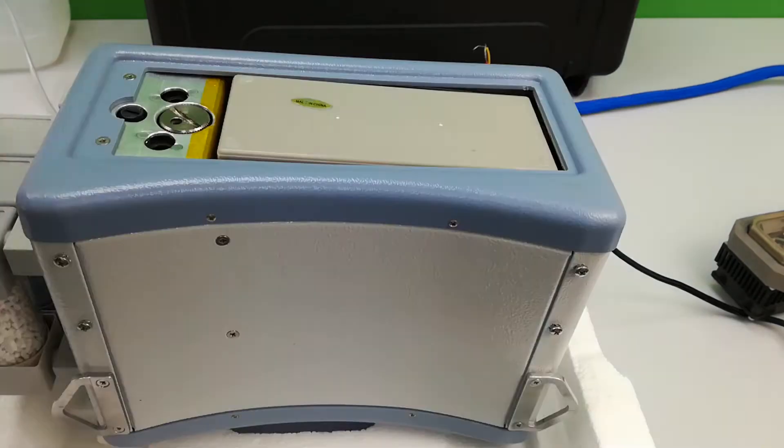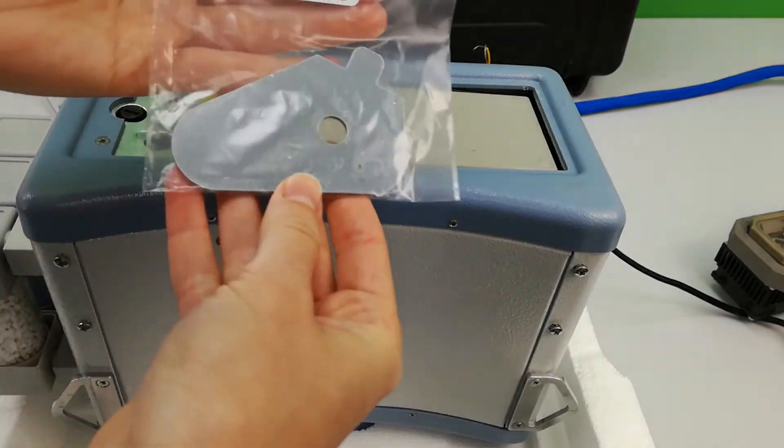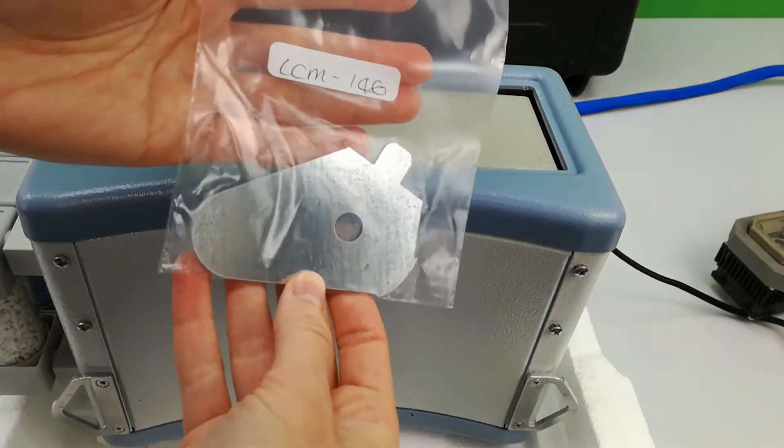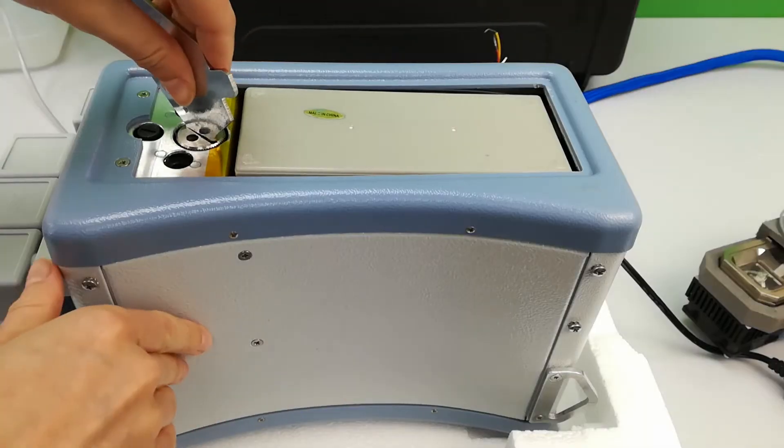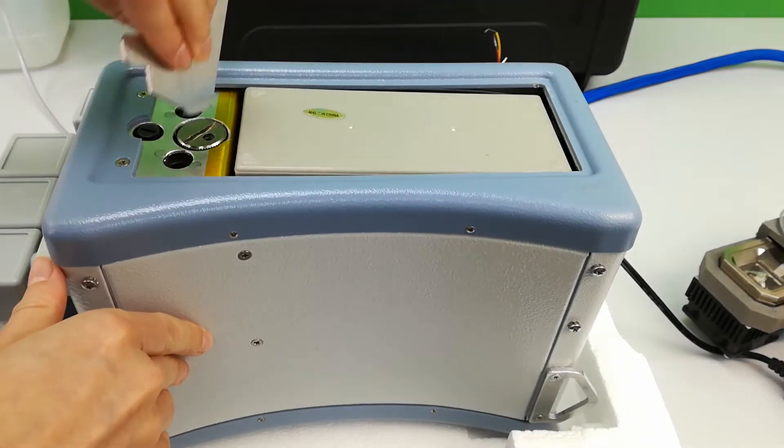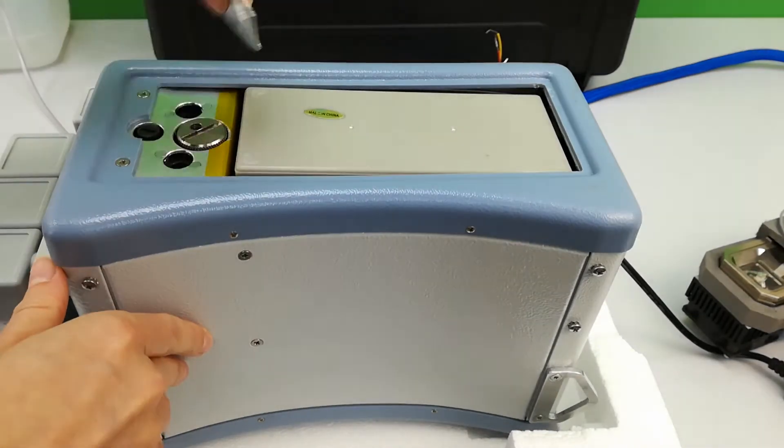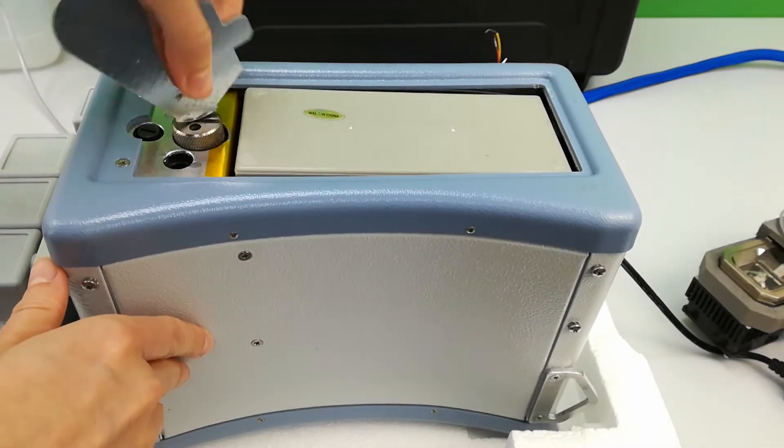Use tool LC-M146 at the wider end to unscrew the cartridge holder.